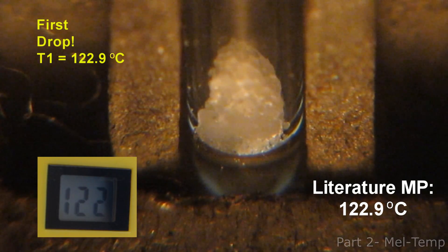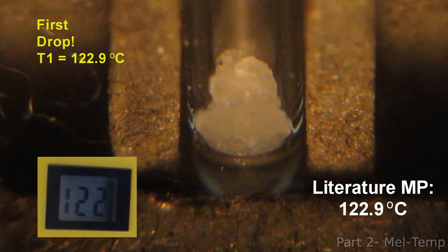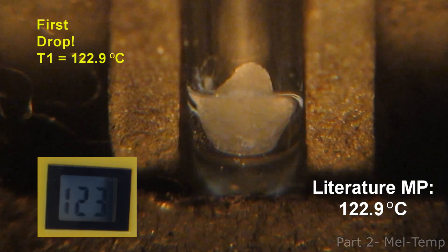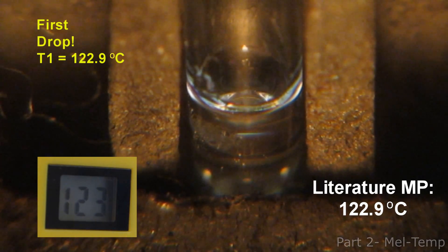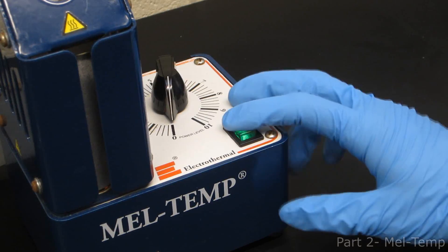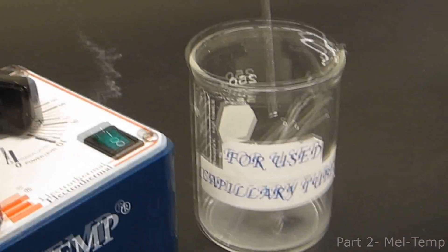The melting range begins when the first crystal begins to melt and ends when the final crystal is a liquid. The temperature shown is of the surrounding metal, not the sample. Turn the instrument and thermometer off, then remove your capillary tube and dispose of it in the proper glass waste container.